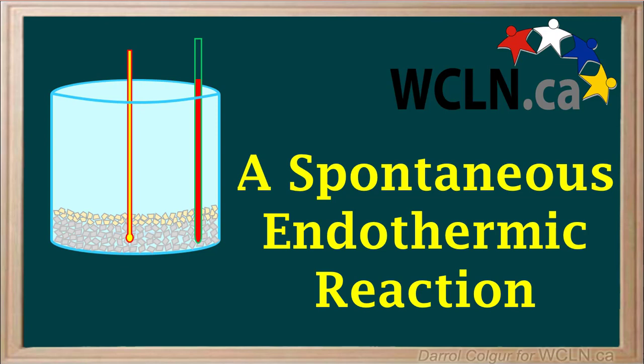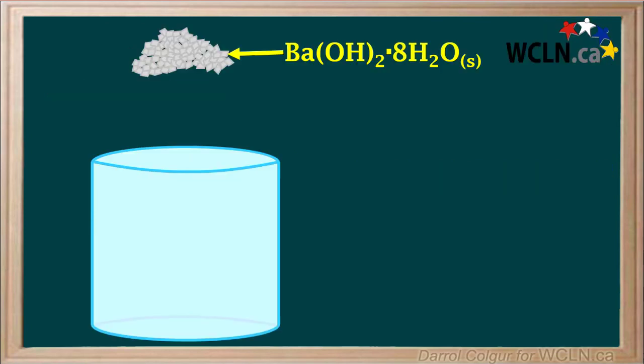Here we'll examine an endothermic reaction and explain why it takes place spontaneously. We'll start by adding some solid barium hydroxide octahydrate to an empty beaker.